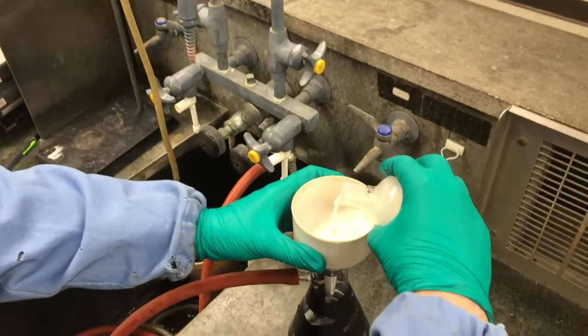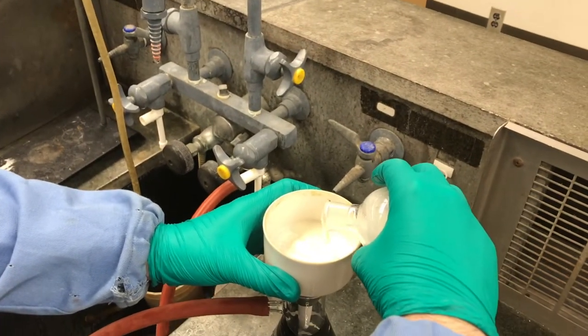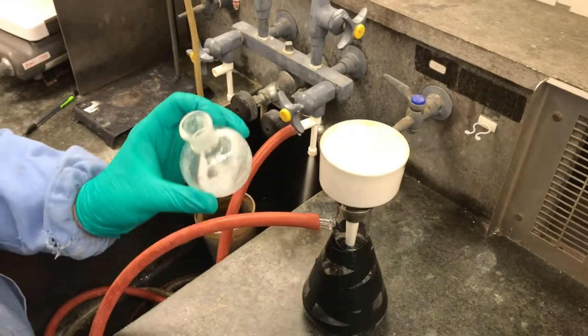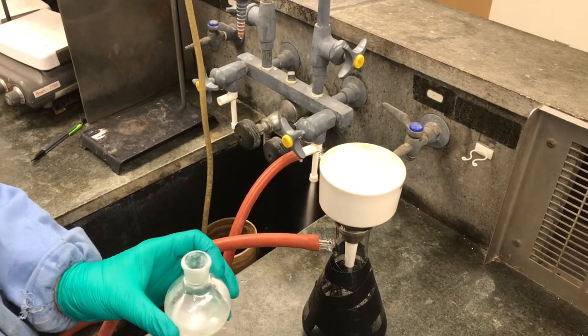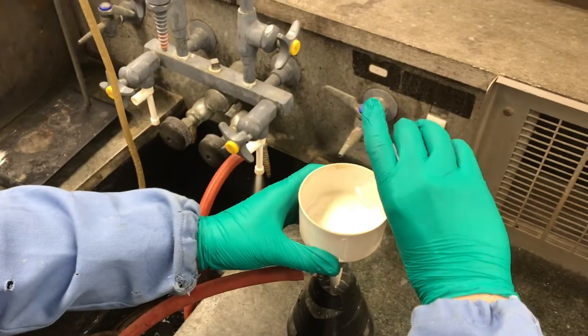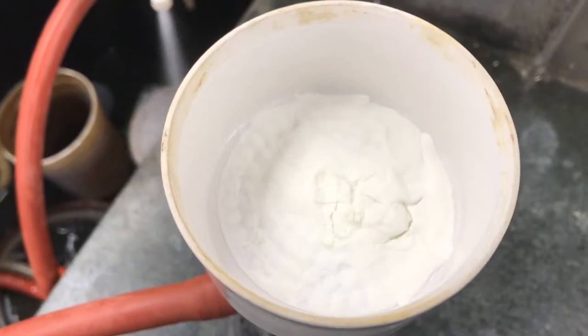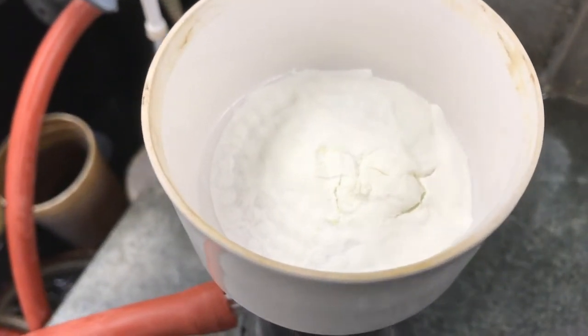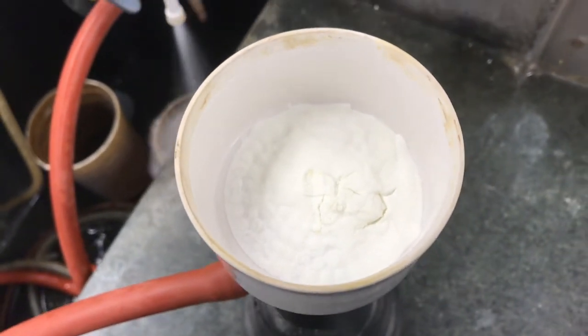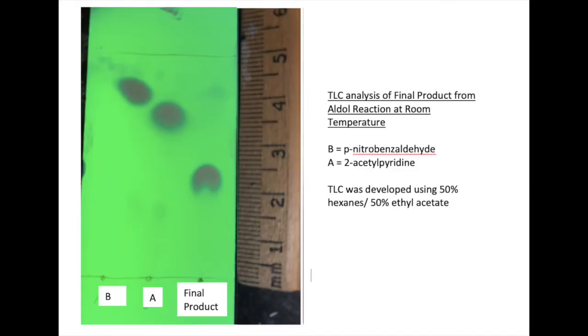Once again, all we need to do to isolate the products is just do filtration. And then rinse with some water. And here's a close-up of the reaction product at room temperature. You can see that this one is not colored like the last time, and it's just a bright white solid. Here's the final TLC plate for the reaction product. You can calculate RF values a lot better with this TLC plate than the previous one.